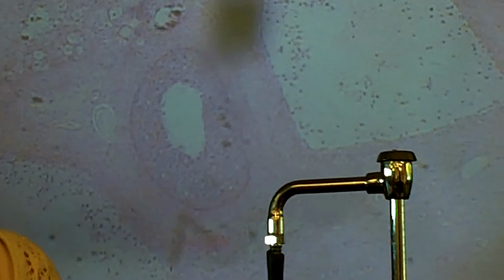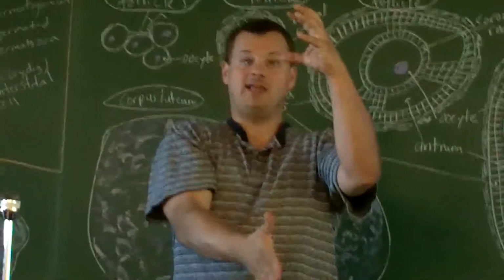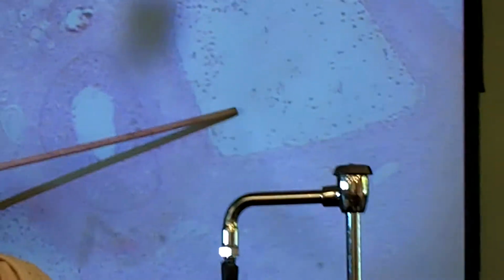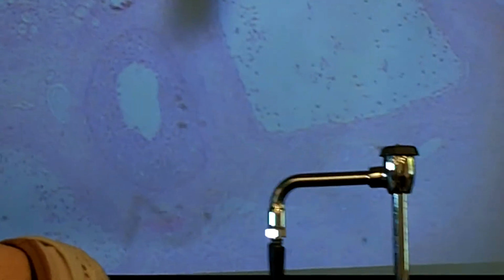Remember, a follicle is not a circle. It's a sphere, right? It's three-dimensional. So if the oocyte is maybe over here, but you slice through right here, you're going to totally miss the oocyte. So don't be surprised if you see a lot of these, which look like empty tertiary follicles. It's probably not really empty. It just happens that the slice went through and totally missed the oocyte.